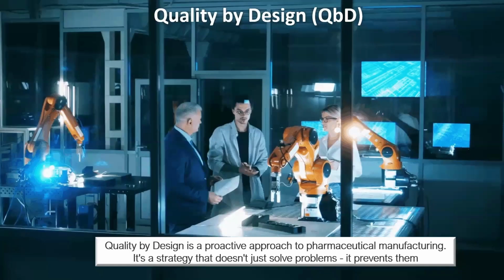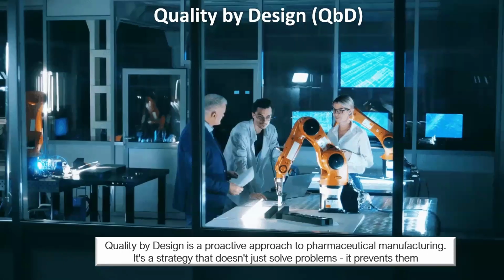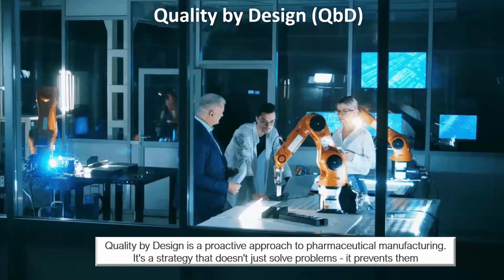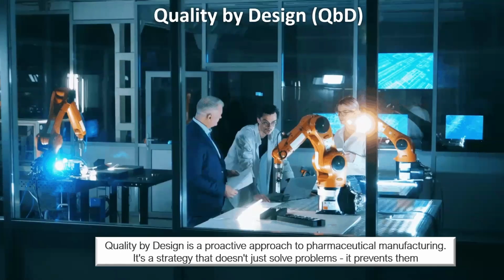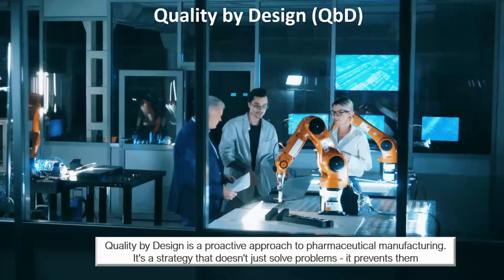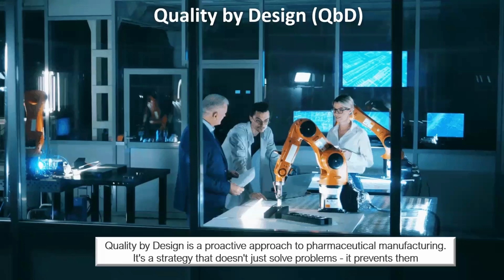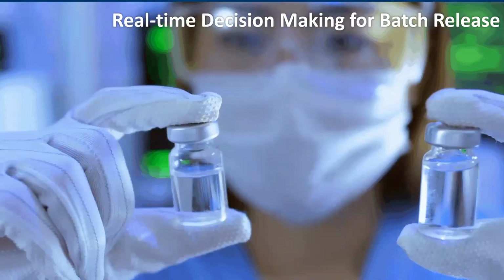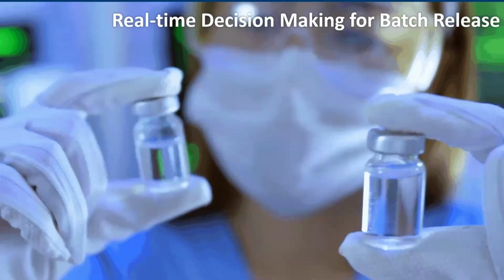I was at an ISP event in Waterford in Ireland a couple of months back where they introduced some of this technology, and there's no human activity at all. It's all automated. Even the introduction of the materials and everything else that's used in the process is all automated. They're really interesting. So with QBD built into your EM systems, real-time environmental monitoring will revolutionize batch release processes.